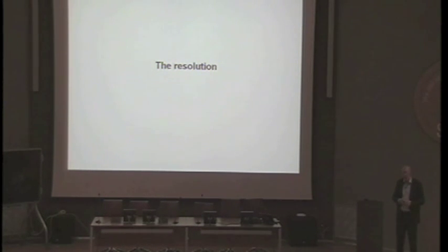Well, the answer to the question is, I should say, twofold. One of them is the conceptual limit, so what you can in principle get if everything is perfect, there are no aberrations, nothing else, and so on. And what is the practical limit that you get? Now, the conceptual limit is important to understand because this is going to stay. This will also be true in 30 years, most likely. The practical limit is something that is a snapshot of development right now. So 19th of December, 2013.